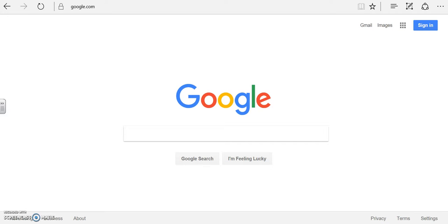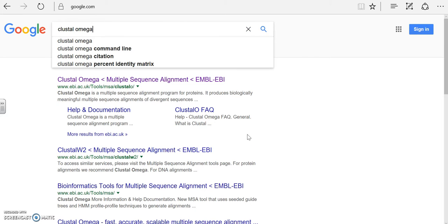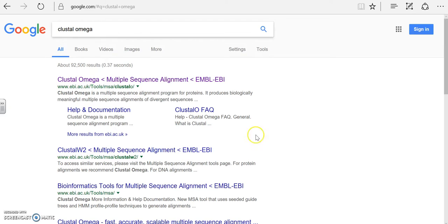We are now going to do exercise three. For this exercise we are going to use a website called Clustal Omega. Go ahead and type that into your search and we will be using this one right here.